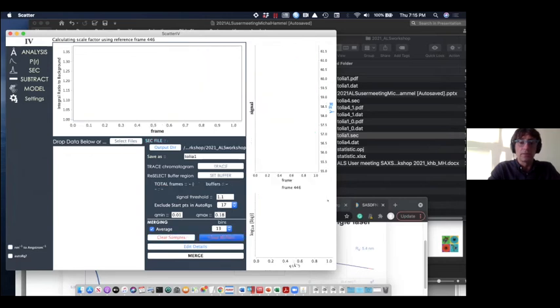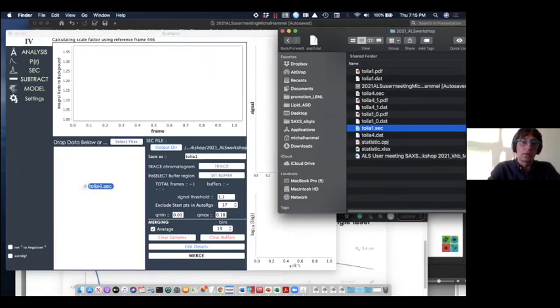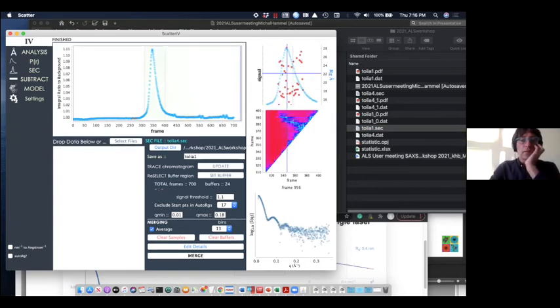So you clear the samples and take your sample, and you already see the signal previously was here about the frame 420, 450. And you should look at the PDF report for the mass data to confirm the molecular weight. I think in this case, I couldn't find the PDF file for the molecular weight. But let's just do only with the SAXS. Again, something is wrong here because the RG is so huge here. So ignore those values here.